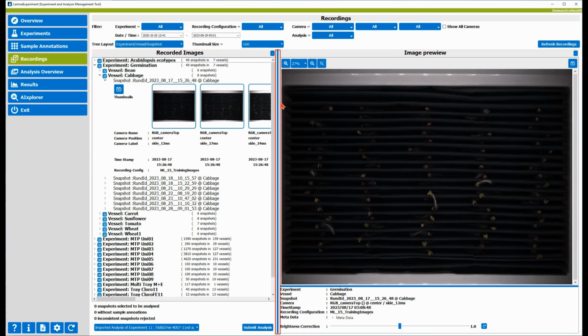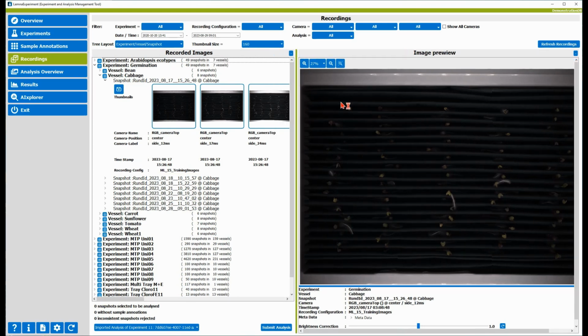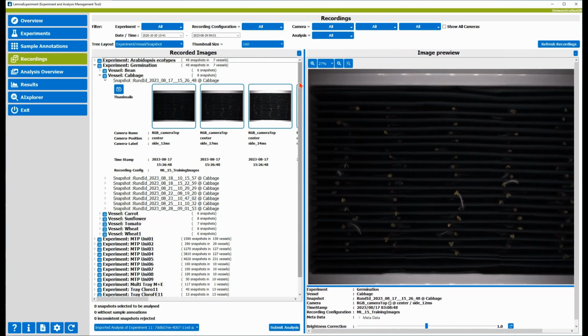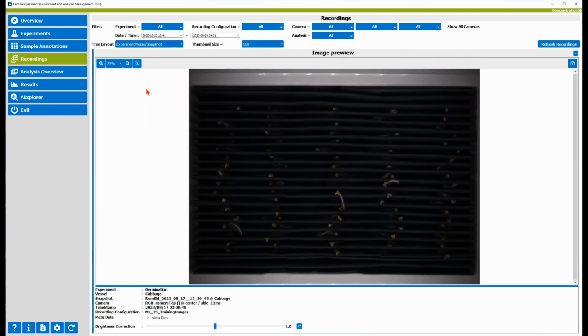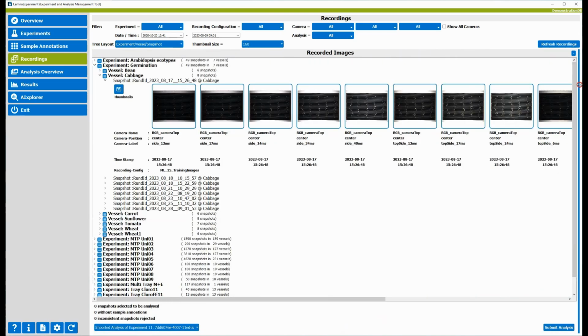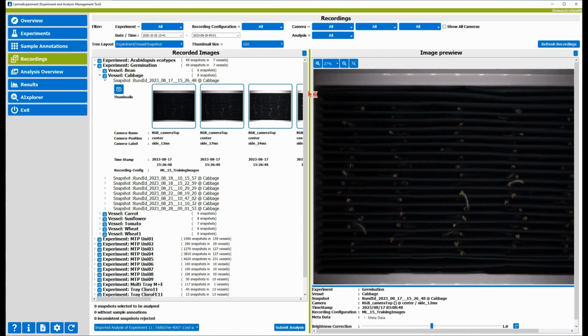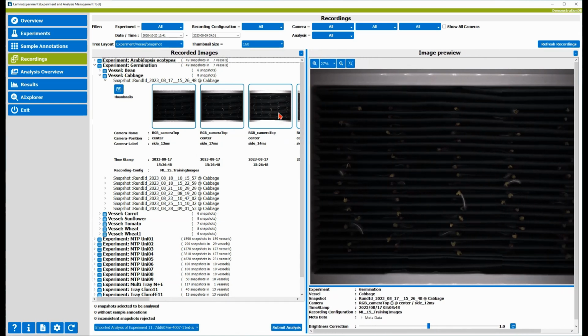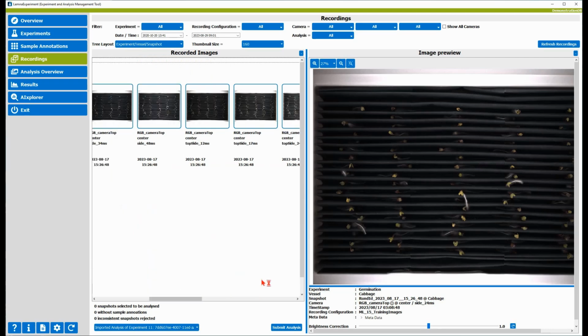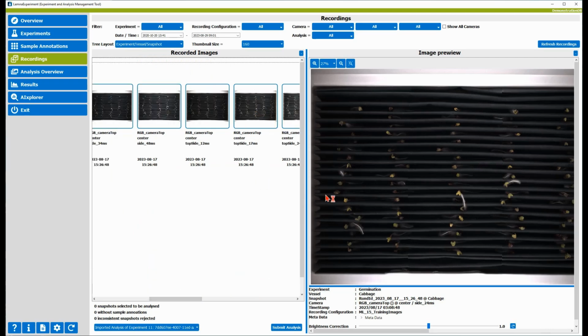You can change the space used by image tree and preview by pulling on the blue bar in the middle. You can also use the minimize button on the top right of each section. If you click on another thumbnail, this image will appear in the preview. If you control-click on another thumbnail, then the second thumbnail will be added to the preview.